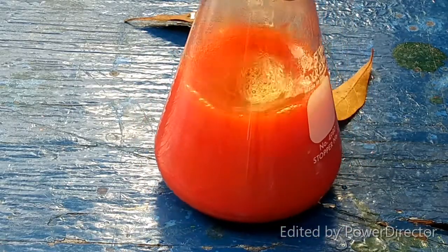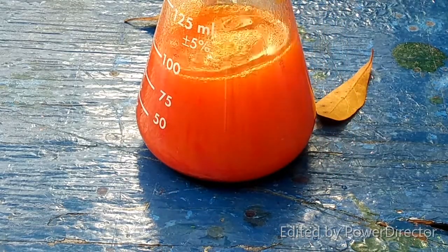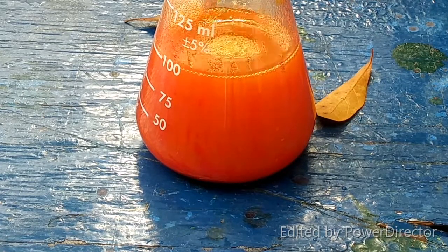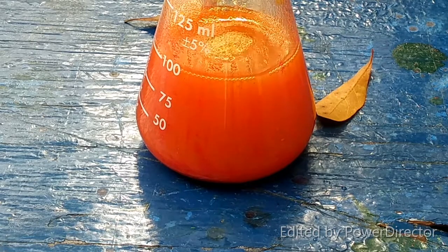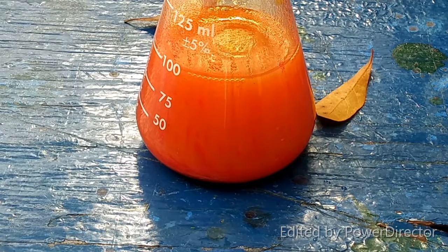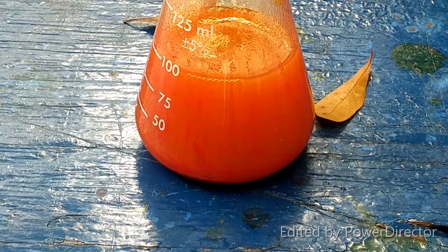But anyway, you can see the powder that's already there as I stir it up. At least I hope you can. It's difficult to see through the solution, or suspension rather. I'm just going to let this keep cooling down at this point. I'll scrape off crystals as they crop up and as needed, and then I will go ahead and filter it all and start trying to figure out what in the world I'm going to do about drying the toluene without being able to put it under vacuum for prolonged periods of time.